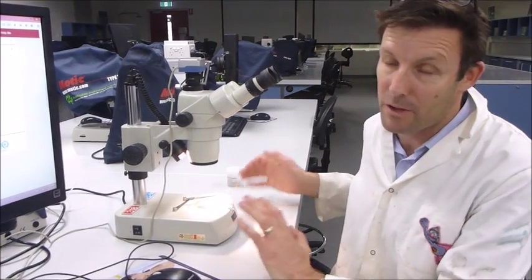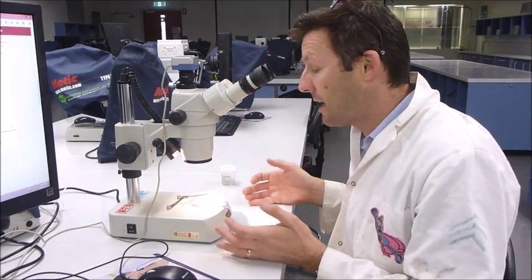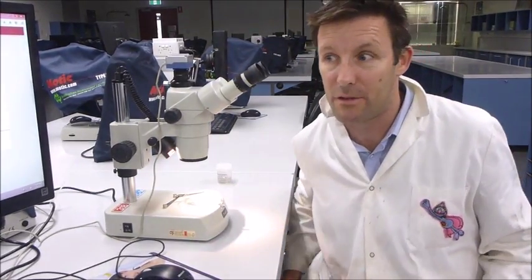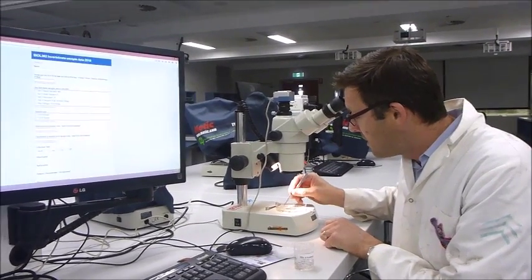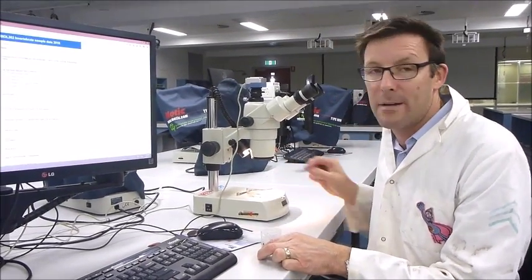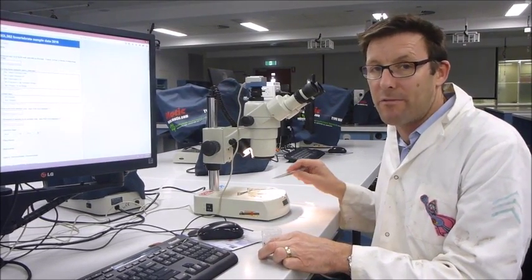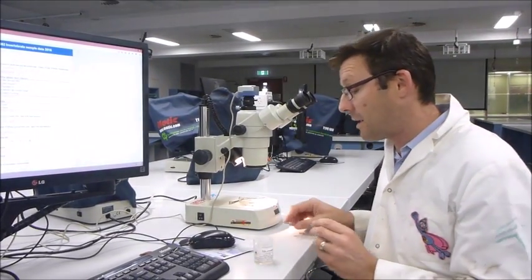You will need your lab book, because you will need to write down how many of each thing you have and what they are, so you need to identify and count them. And we'll identify to the family level. As I count and I identify my bugs, I'm going to put them back in the ethanol. So at the end of the day, at the end of the class, all your animals should be back into ethanol. Even if you don't get through to finish the whole sample, please put everything back into the ethanol, and we'll pick up where we left off last week.